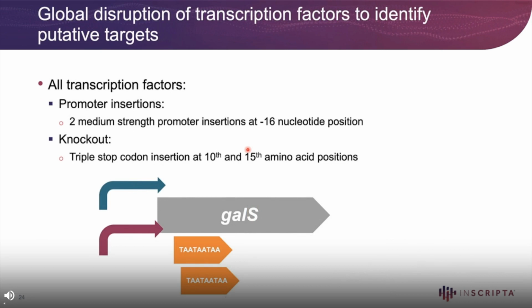Because there are a couple of different hypotheses for what could be going on, our first library that we wanted to build, we thought should be a more general library rather than with the Coumaric acid where we built a gene-specific library. With this, we built a genome-wide library that was designed to target a lot of different genes, specifically transcription factors, and see what the results of that suggest, and then based on that, narrow it down to what we think could be going on.